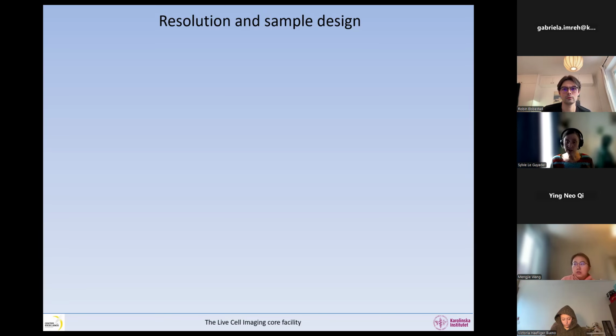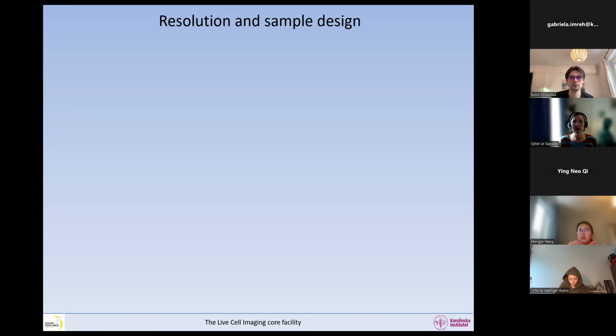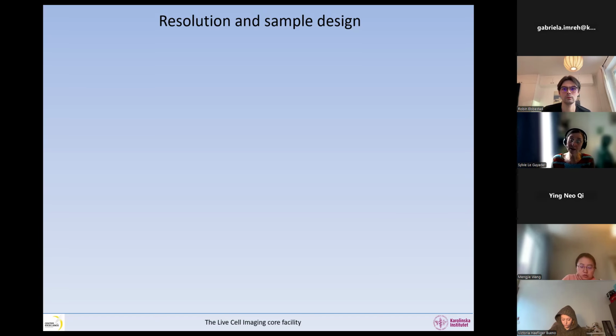It's sometimes a little bit hidden. Zeiss, and I'm not sure about Leica, but Zeiss sets the pinhole for the shortest wavelength, which means that the long wavelengths are going to be dimmer than if they were at one Airy unit. So for the long wavelengths, the pinhole is going to be lower than one Airy unit, but the short wavelengths are at one Airy unit.